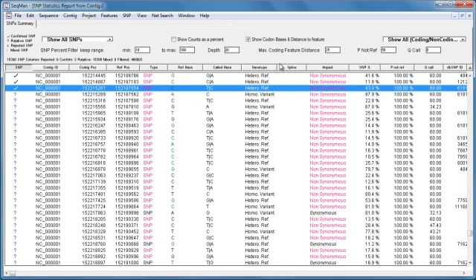Now I want to mention that you can use the same workflow to create a template package starting from a GenBank or FASTA file as your reference sequence. And this is useful if you're working with a non-model organism but want to have your own annotated SNPs.